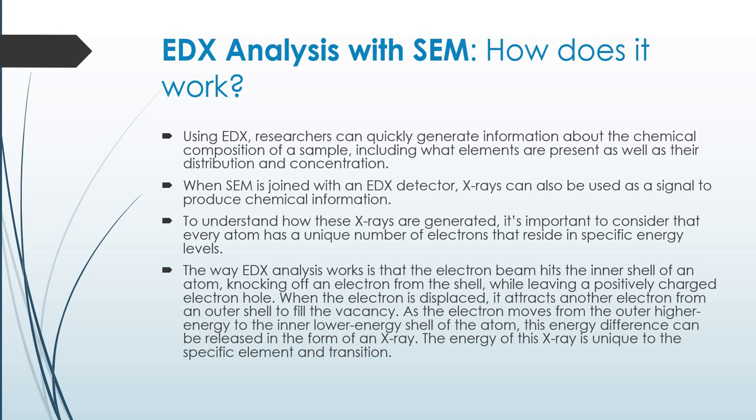An EDX detector can generate more information about a sample than SEM can alone. Using EDX, researchers can quickly generate information about the chemical composition of a sample, including what elements are present as well as their distribution and concentration. But how exactly does EDX work?